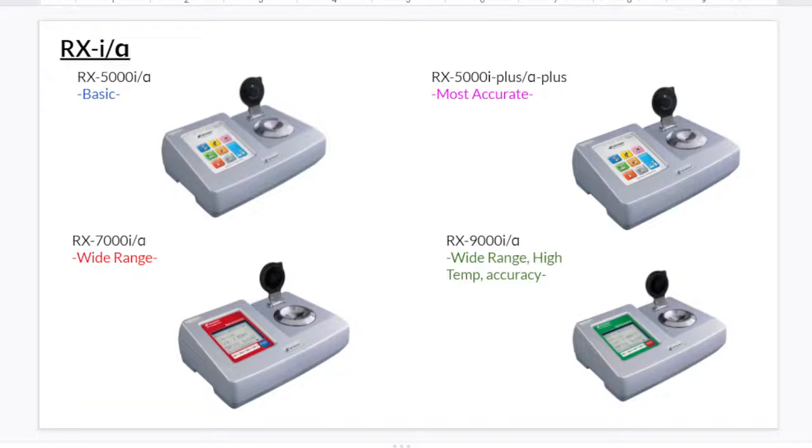Here are some instruments that have both I series and α series. The 5000 is a basic one. The 5000i Plus or α Plus has the most accurate measurement. The 7000i and α has a wide range. And the 9000α and i has wide range, high temperature, and high accuracy, so it can measure samples with high temperature.